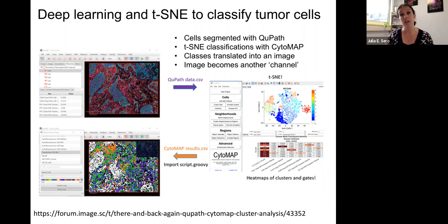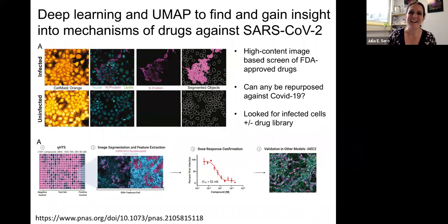So again, a number can be an image, an image can be a number, and we can transform them, and we can work with them as arrays of numbers, or as arrays of numbers that are represented as an image, which I just think is a very fun thing to do. And then I'll just end with one which is kind of topical and uses UMAP.